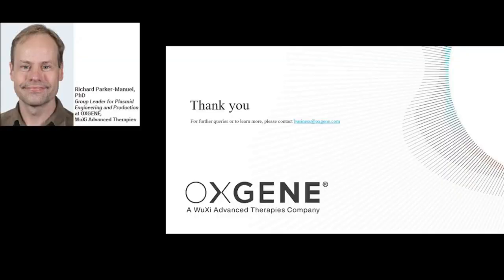Okay, great. So the first question is, how long is a custom cloning project for a research-grade plasmid likely to take? Thanks for the question. That depends on a lot of variables, such as whether the project will involve DNA synthesis or simply subcloning from an existing vector. It depends on how long the custom components are, such as the promoter, the coding sequence, and any other regulatory elements, and whether the custom elements contain any regions of very high GC content, for example, or secondary structure. So it could take as little as 2 weeks or perhaps as long as 6 to 8 weeks.